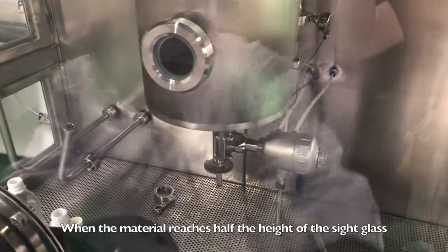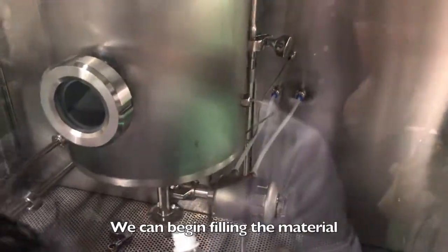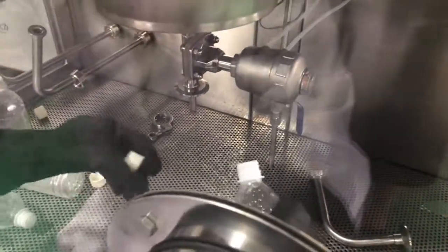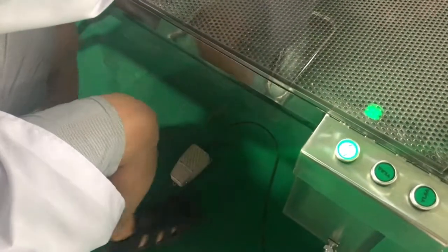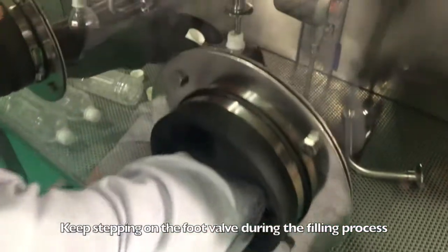When the material reaches half the height of the set glass, we can begin filling the material. Keep stepping on the foot valve during the filling process.